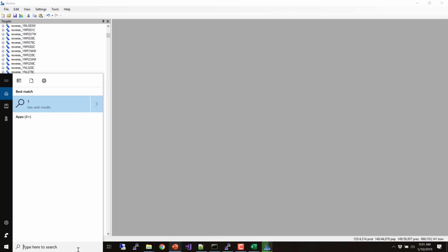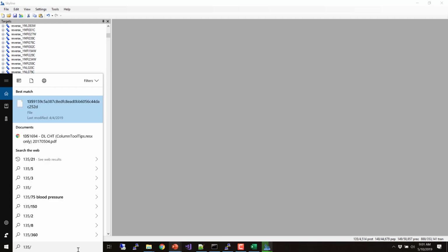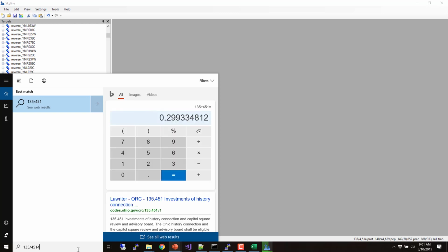And then let's do what it is at the protein level, 135 divided by 4,514. And so that's about 3%, right? But there's one caveat here: because I've got so much of the proteome, at the protein level, even when I have false discoveries in peptides, a lot of them are probably hitting proteins that I actually have in my sample.